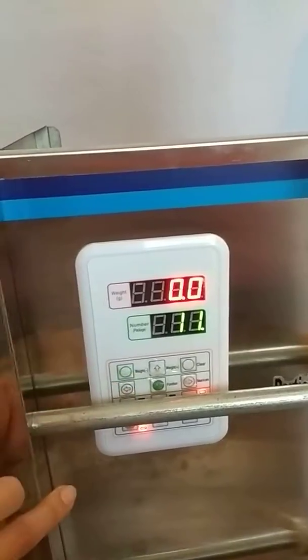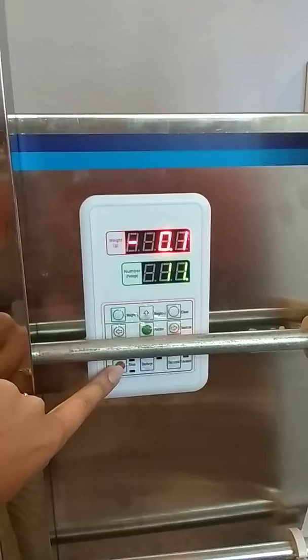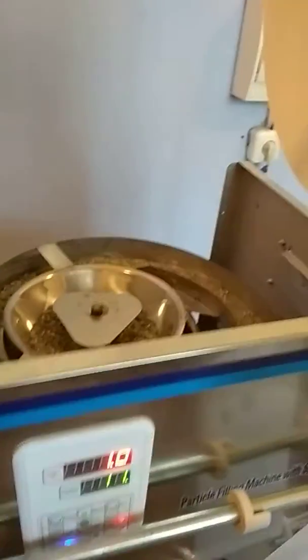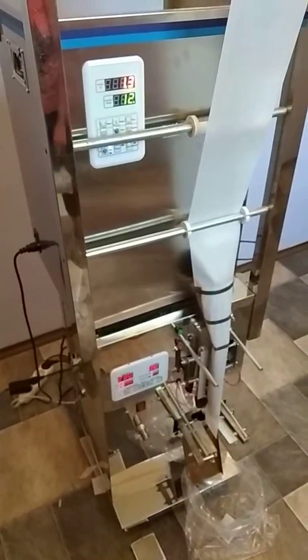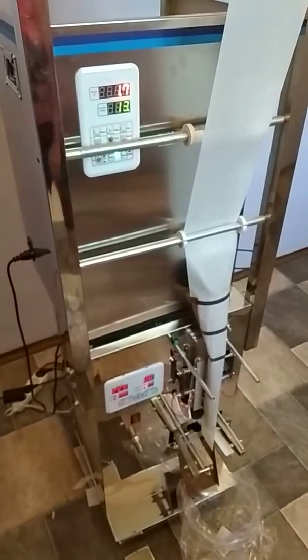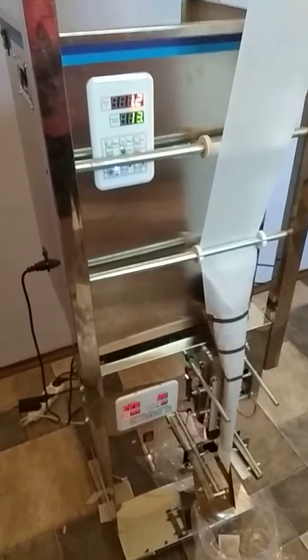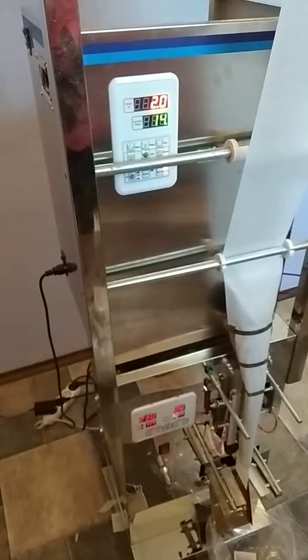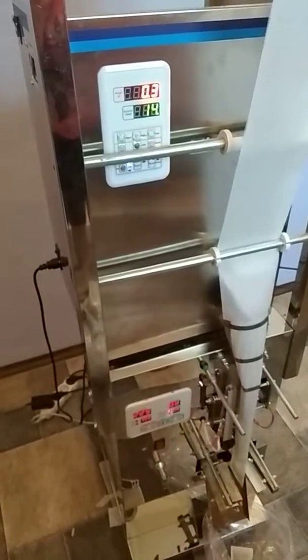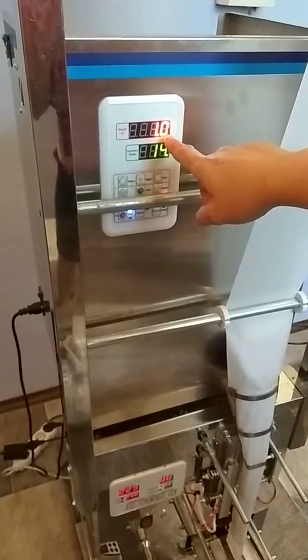We set up the machine to measure two grams of material. We push start and the machine is running and taring. The weight is already showing a value below zero.